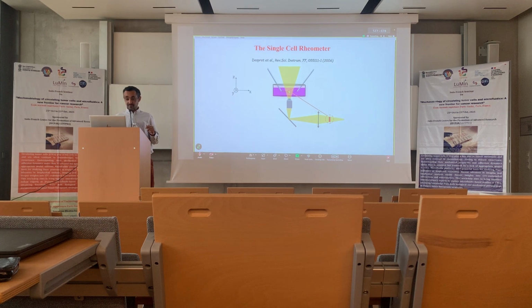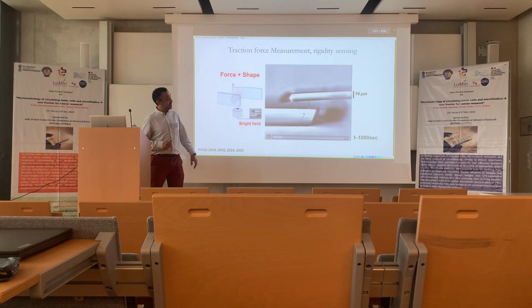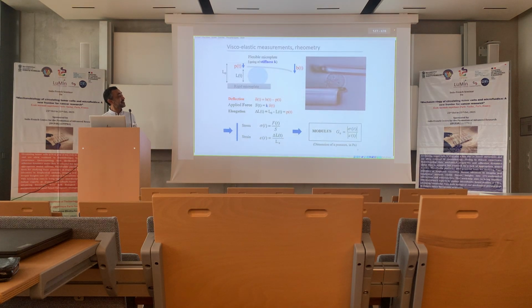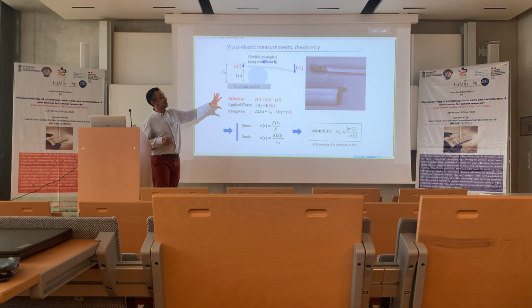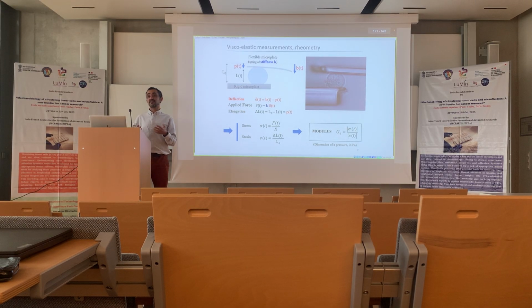For instance, and I won't go into this today, but I want to show you, we can measure forces, for instance a single cell just pulling on the cantilever. We can change stiffness and measure adaptation to stiffness in this very simple geometry. But today I'm going to focus on the other way around: applying forces or stress and seeing how the cell deforms. So just doing rheometry.